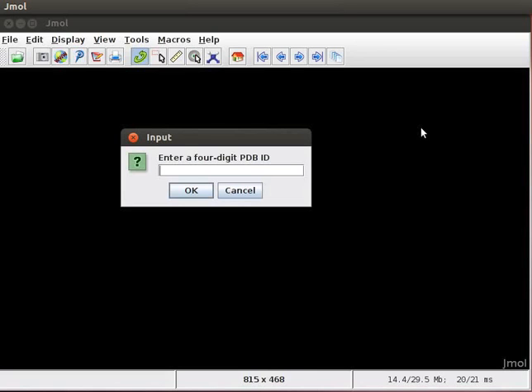If you are connected to internet, you can directly download the protein structure on jmol panel. Type the 4 letter pdb code 4EX1 in the text box and click on OK button.